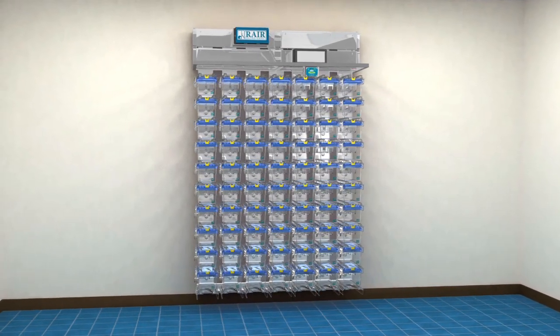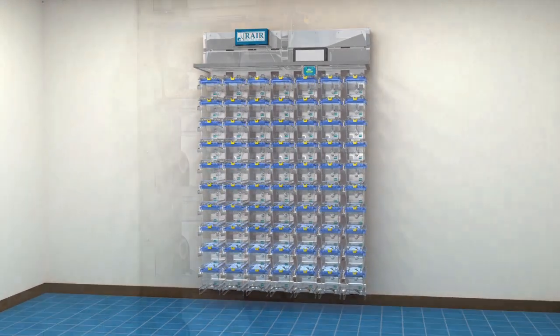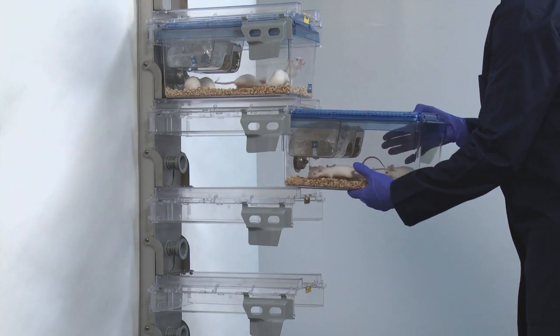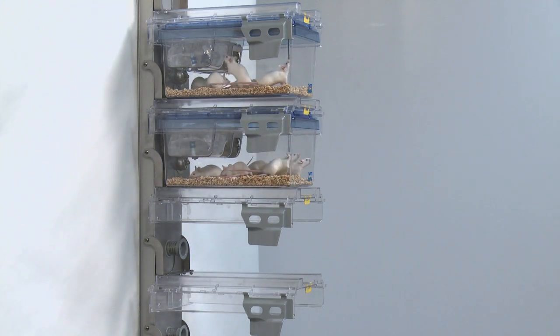Maximize available space with the Rare wall-mounted ventilated housing. With the load-bearing structures at the back, the front is wide open, completely free of columns or bars.